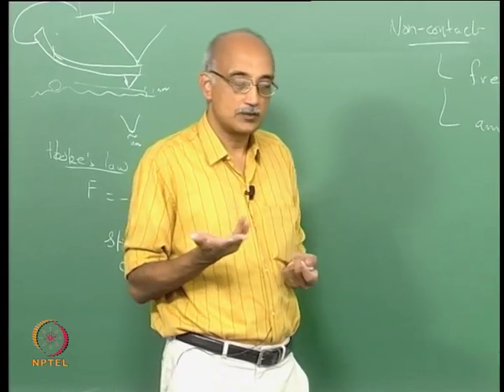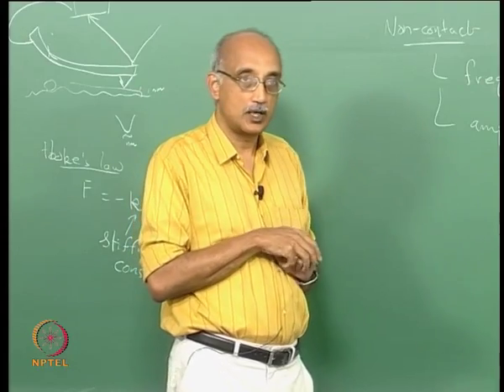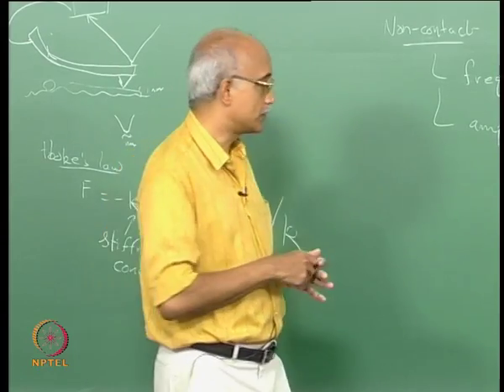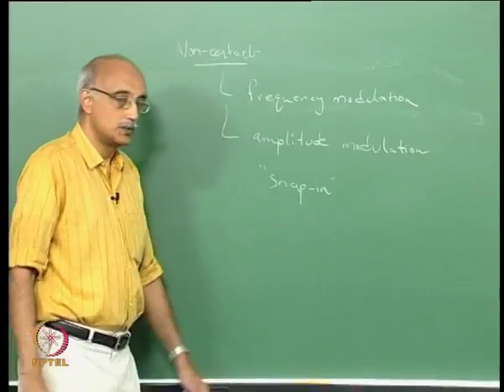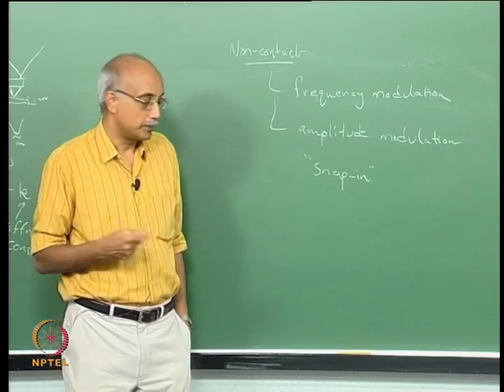All of a sudden, if you have a spike in the surface, that can cause this kind of snap-in to happen, or all of a sudden you have a high surface energy material that the probe experiences, it will immediately get sucked to the surface, and this snap-in is a problem because it may lead to irrecoverable damage of the probe tip, which would need to be replaced.